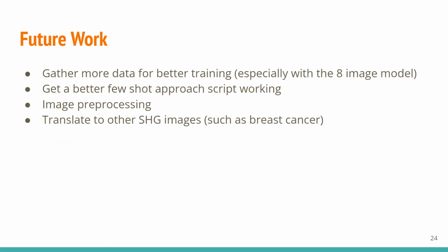So for future work, we would potentially gather more data for better training, especially for the 8-image model. We only have those 40 slides that we got. So that would require gathering more slides from Maine Health Research Institute.